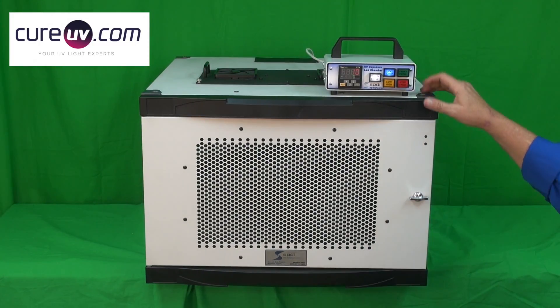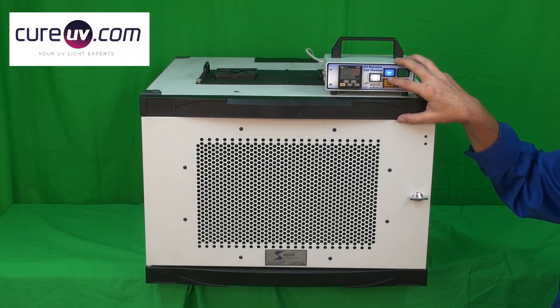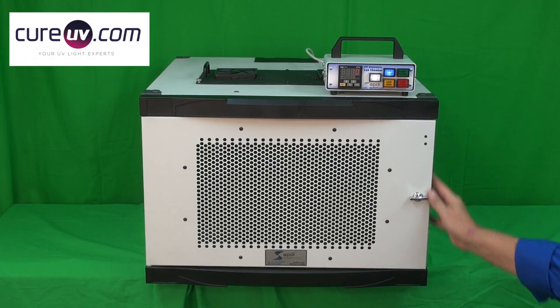This UV exposure lab chamber provides you an easy method to document and later recreate the same experiment that you might have done in the past — virtually any configuration of exposure that meets your scientific or development needs.